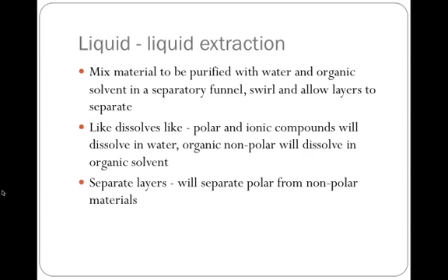What you're then going to do is mix the material to be purified with water and an organic solvent in a separatory funnel, swirl those around and allow the layers to separate. There'll be an organic layer and an aqueous layer, the water layer, and different molecules will be differentially solubilized in the two layers. Like dissolves like, so the polar and ionic compounds will mostly dissolve in the water and be in the water phase. Organic solvents are much less polar, and so the organic materials, which are also less polar, will dissolve in that organic solvent. You can then separate the layers and separate polar from nonpolar materials.